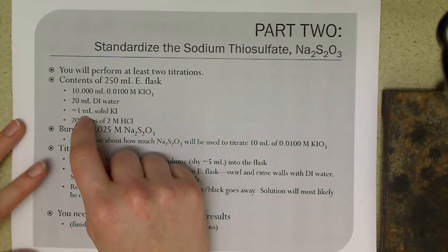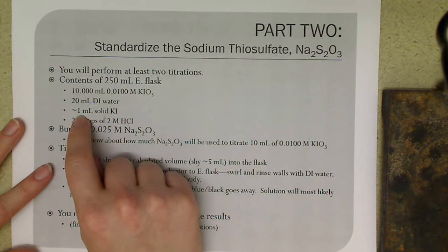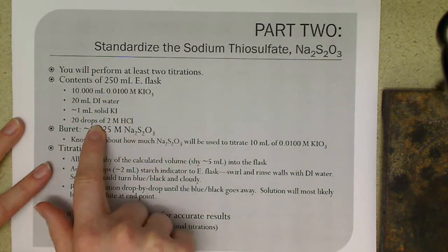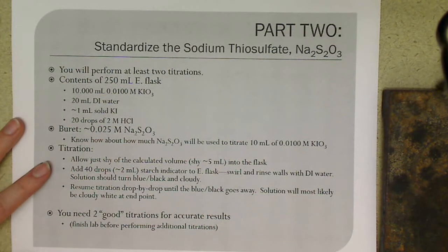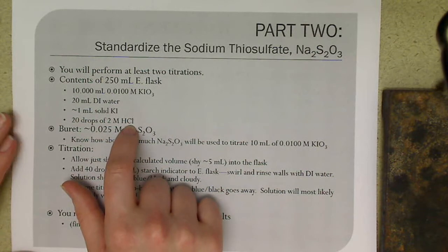You are going to measure your potassium iodide rather than putting it on a balance, you're going to measure it according to its volume. So probably easiest to use your smallest graduated cylinder, and make sure you don't wash it. Keep it as dry as possible. That's why you want to prep your glassware in advance. Then you're going to add 20 drops, which is about 1 milliliter, of 2 molar HCl.